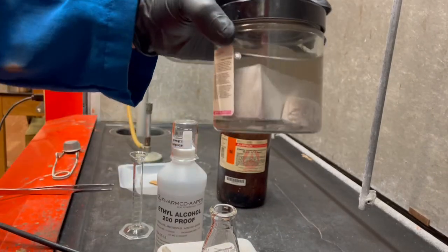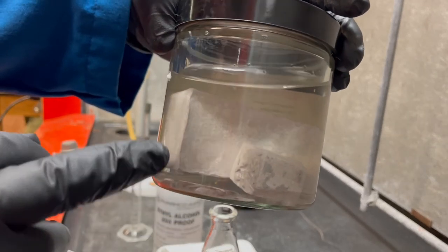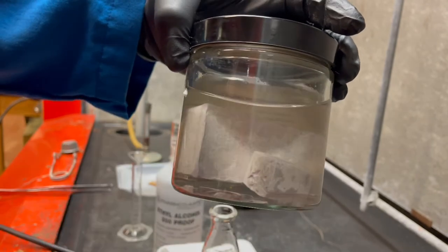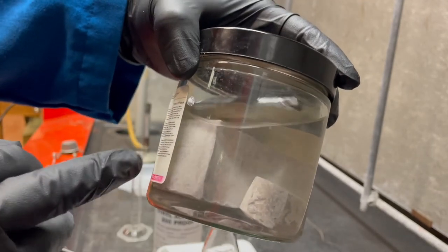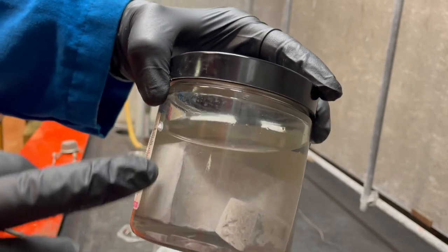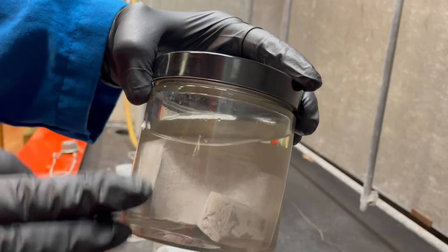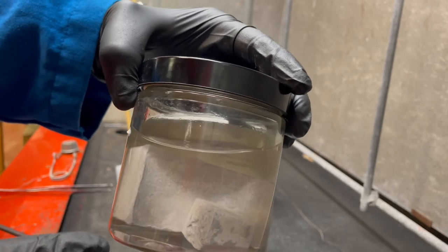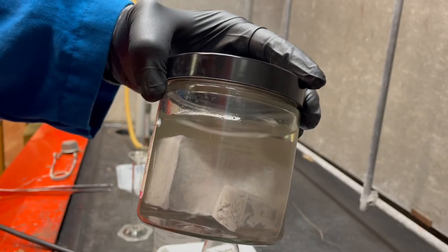So what you can see here is like a giant brick, right? This is literally just a piece of sodium, and you can see it's not really a nice shiny color like typical metals, but that's because it has an oxide layer on the outside. And so in order to expose the reactive elemental sodium, I have to cut it up.